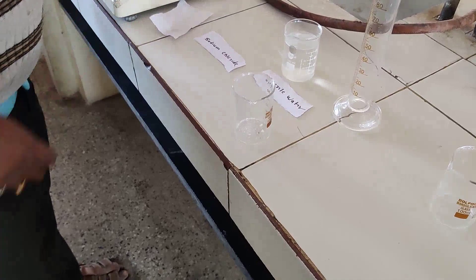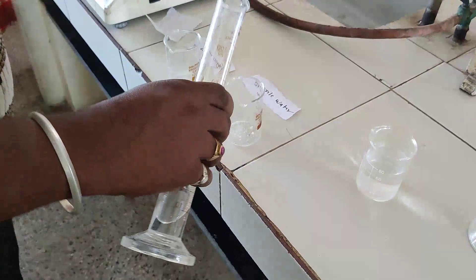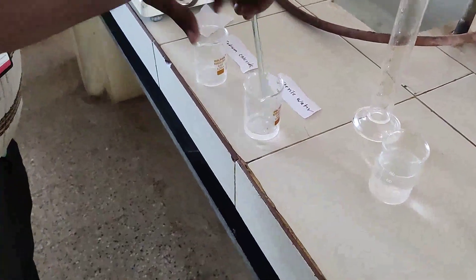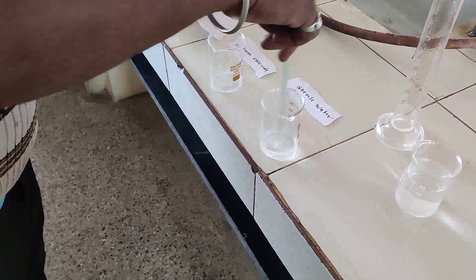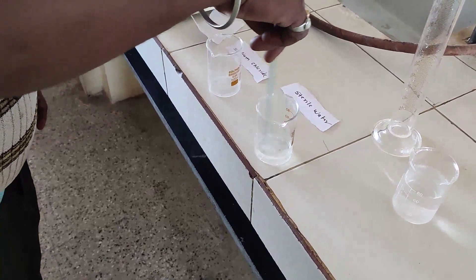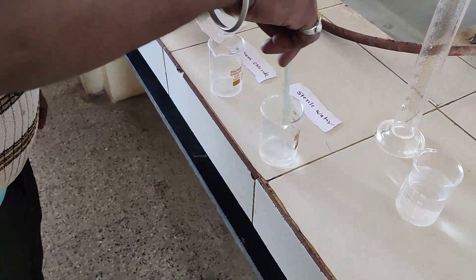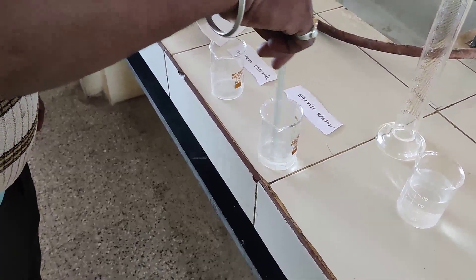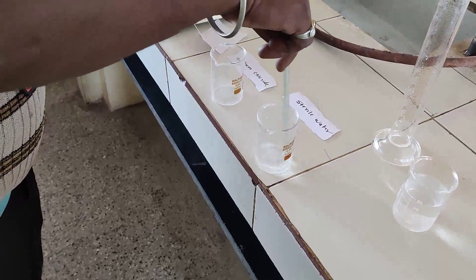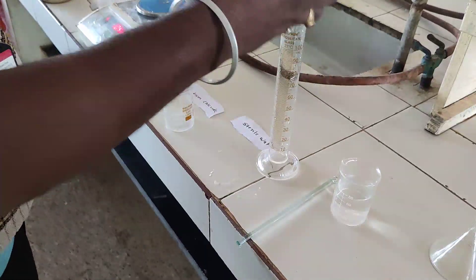Take the sodium chloride in a sterile beaker, then add sufficient purified water and stir with a glass rod so that all of the sodium chloride gets dissolved in water. Stir it well so that no residue of sodium chloride remains.